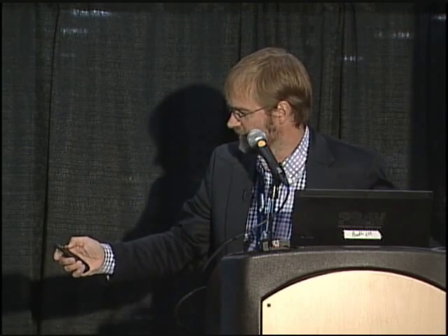It also shows you that nowadays microfluidics has progressed to a state where you can actually make very, very complex microfluidic chips possible. And you will not only get these devices to work, you will also find somebody to actually make these for you also in high volumes. So this one here is actually one example of a fairly complex device. It's a sample in, answer out cancer diagnostic chip. It has on-chip reagent storage. It has amplification detection on a chip. So it's fairly complex.